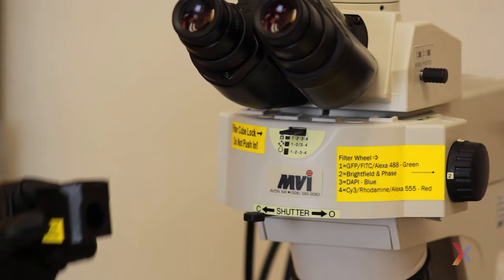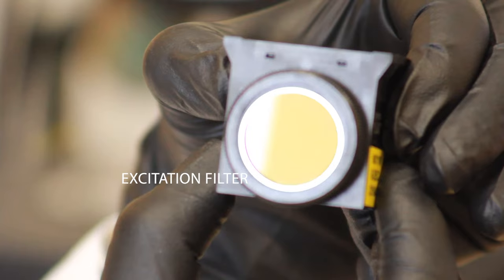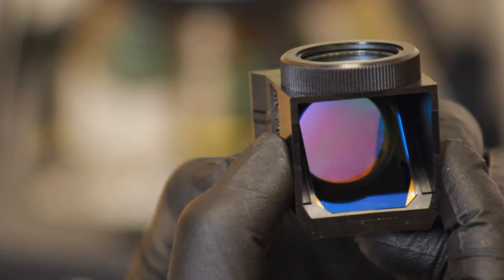Remember we use a filter cube to separate out our excitation and our emission light. So let's take a look at a filter cube up close. So first we have our emission filter, our excitation filter, and the dichroic mirror positioned between them at a 45 degree angle.